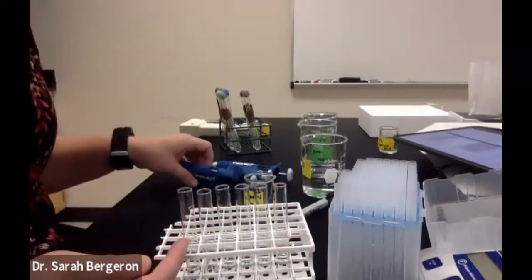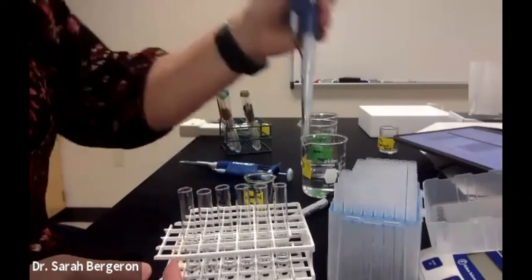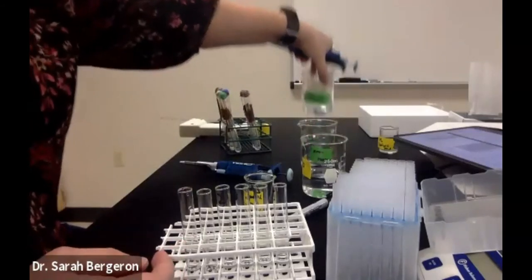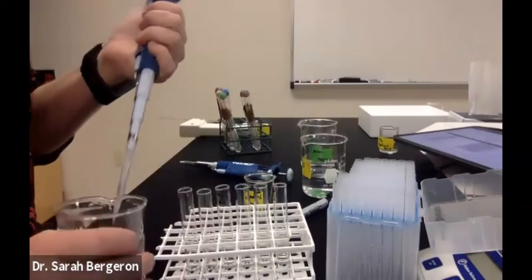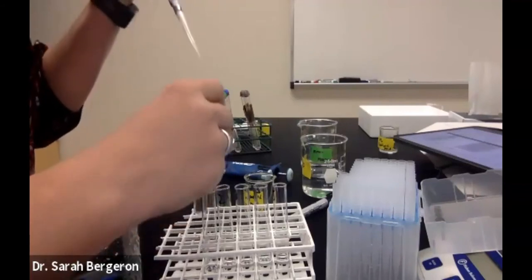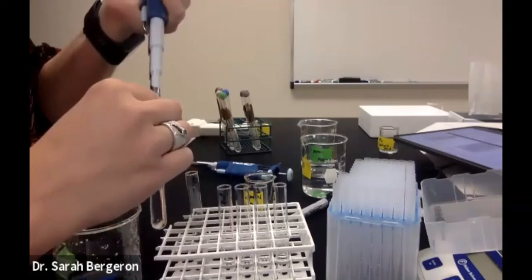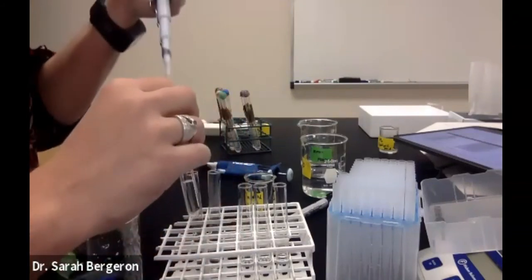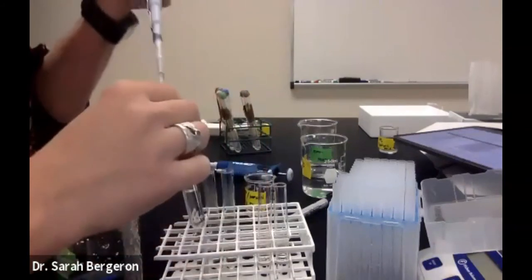So now what I'm going to do is add my other reagents. I'm going to add my ascorbic acid. My ascorbic acid, I need 500 microliters. So here's my ascorbic acid, and I am going to add 500 microliters. And what I'll do for y'all is add the manufacturer's information for each of the reagents on Moodle so that you have them for your lab report. So that's my ascorbic acid.